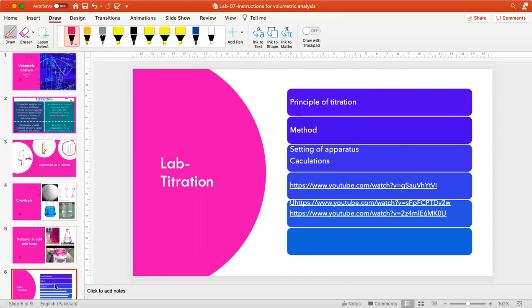अब जैसे ही हम इसके अंदर ऐड करेंगे burette में you will take HCl and known volume of sodium hydroxide in the conical flask, right? For example, 20 milliliters आप ले रहे हैं. So then with drop wise, we add HCl from the burette to the conical flask. And before adding the HCl, we put 2 or 3 drops of indicator, which is commonly used for the strong acid and base is phenolphthalein.